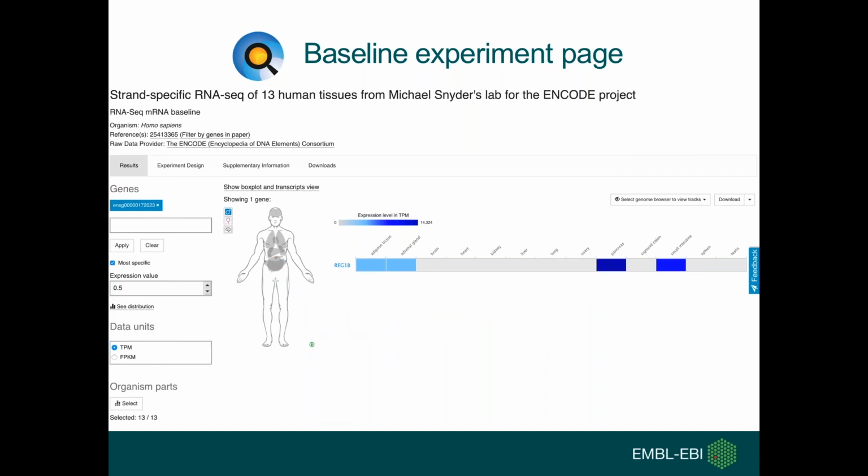The results page also allows you to search for other genes within the dataset. You can search for a number of genes by typing your gene of interest into the search bar and clicking apply.